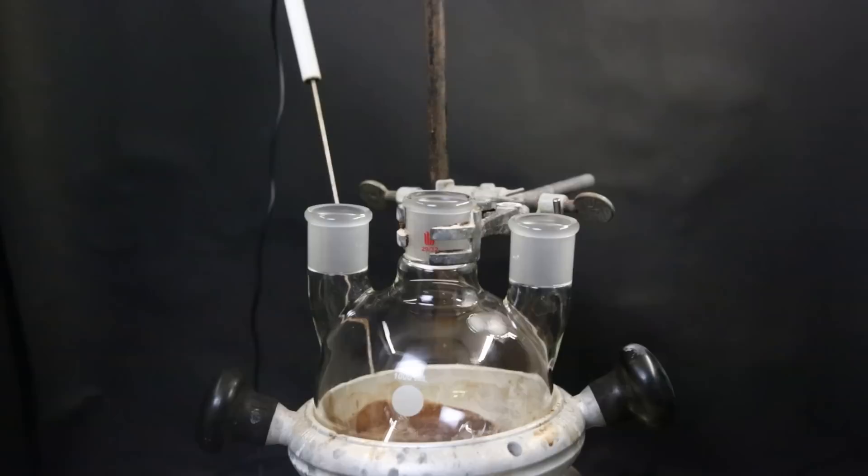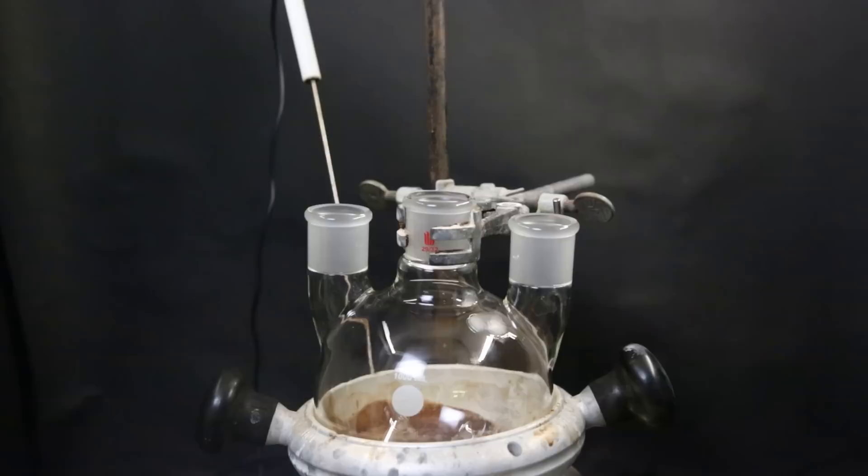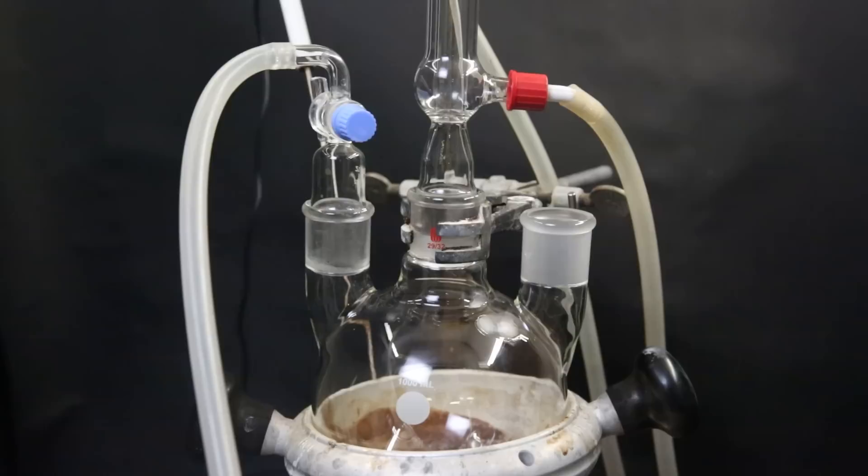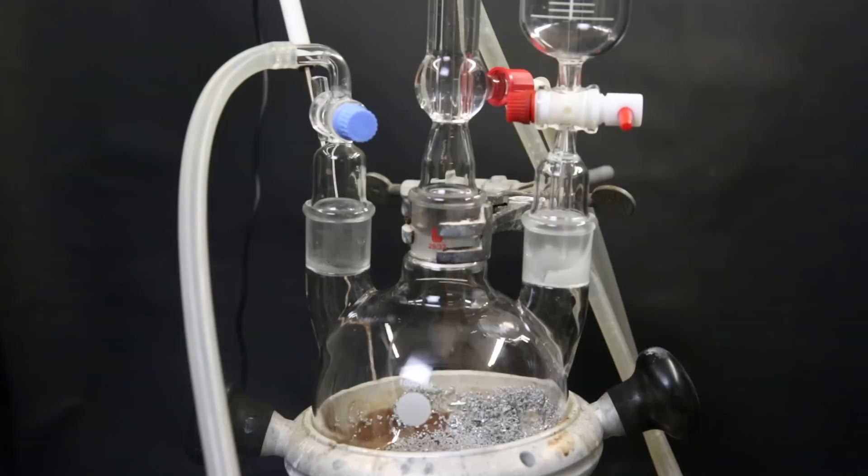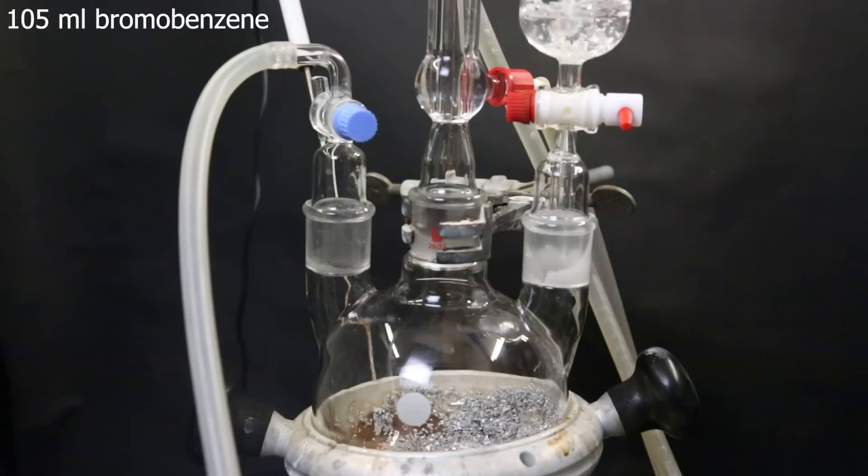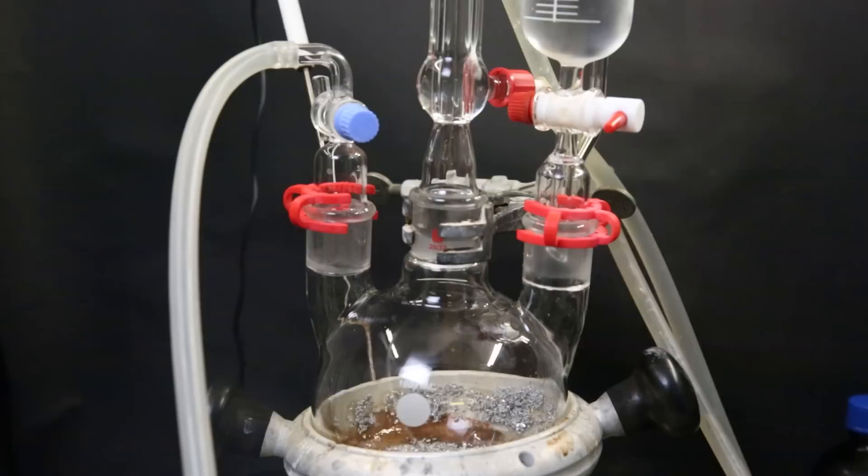So to get started, I set up a heating mantle and a 1-liter 3-neck flask. Then I attach a condenser and a gas adapter with a nitrogen line. I drop in a stir bar and attach a funnel. And then add 23.7 grams of magnesium turnings. On top of that, I add in 40 mils of ether and then swap the funnel for a dropping funnel.